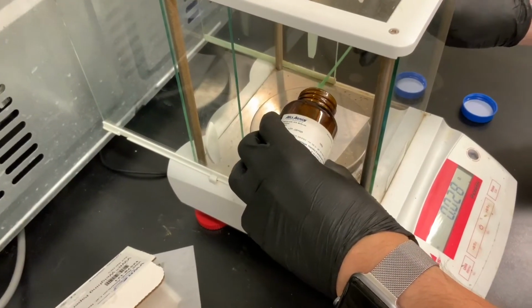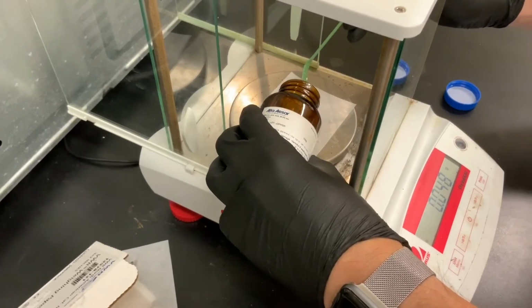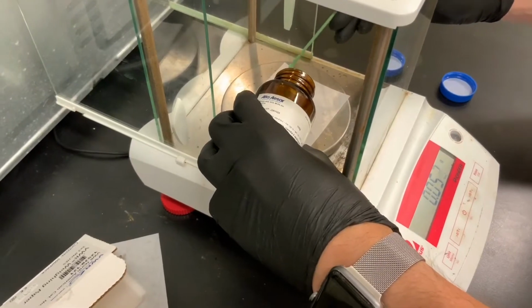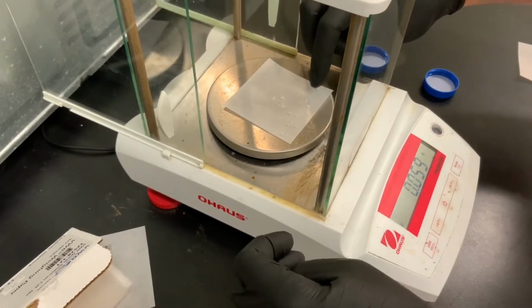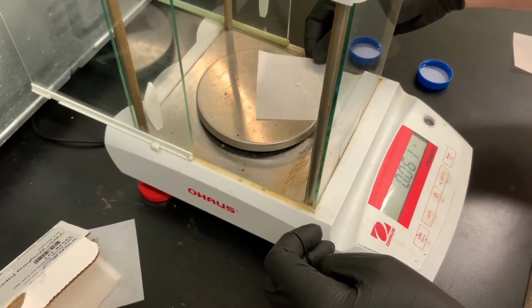But what I'm doing is I'm just going to scrape the walls of the glass towards the top of where it is, where the cap goes rather. And I've got 59 milligrams, 0.059. That's okay. We can use closer to 60 for one of the parts.